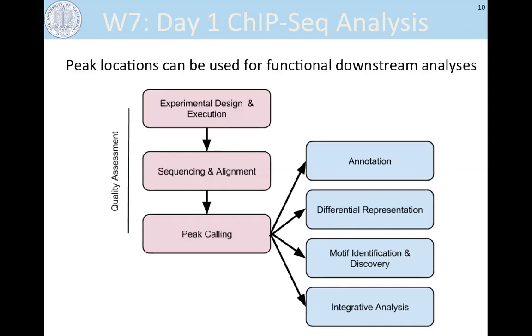Yeah, that's a great question. Most peak calling programs will normalize for that internally. So it's good to have as much sequence as you can, obviously. But if, for example, you have twice as many mapped reads in your input, they'll downsample the number of mapped reads in the input to match the ChIP. Gotcha. So it's not masking enriched sites. Does that make sense? Yeah, thank you.